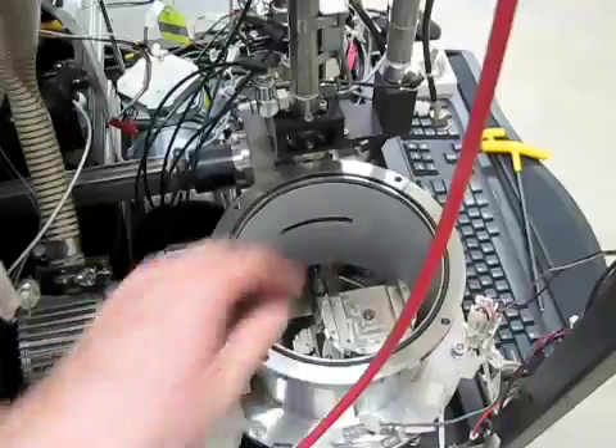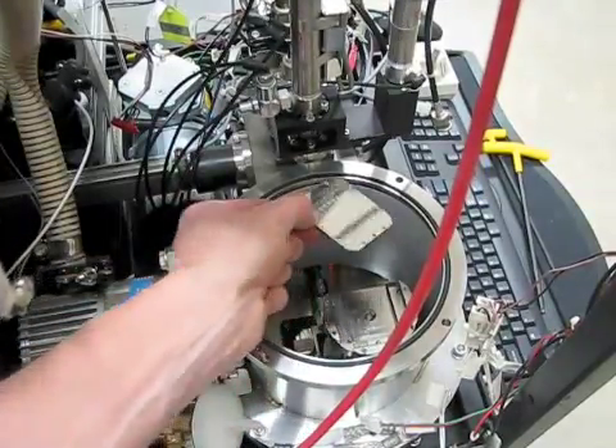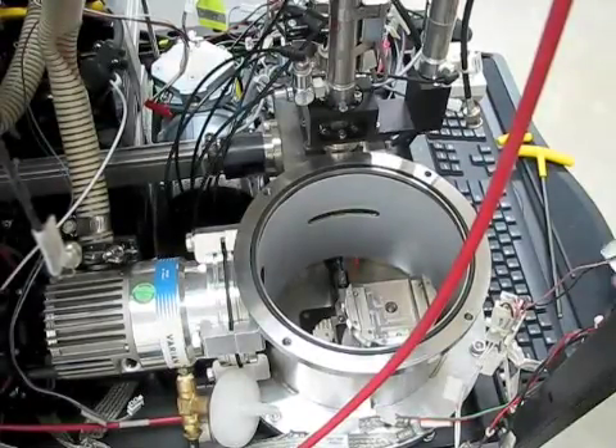Now if you have a plate that has dropped off in the sample chamber, you can remove it now. Try not to touch anything with your bare hands but the sample plate. And that's it.